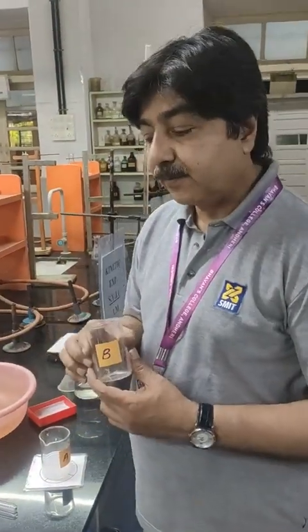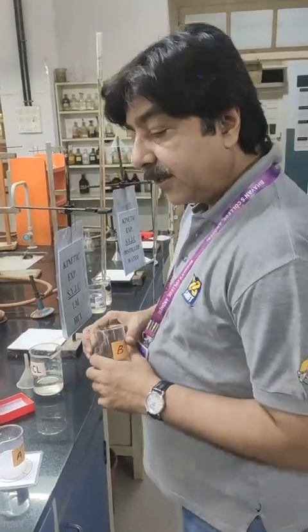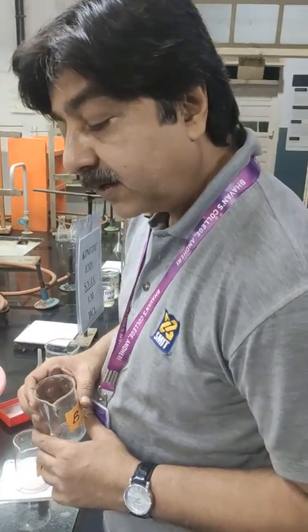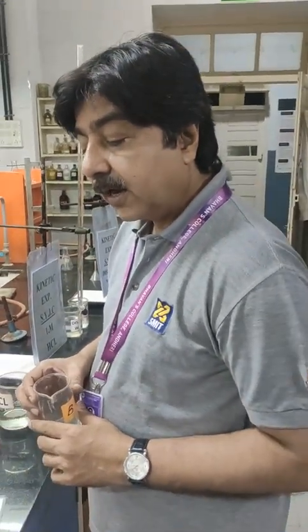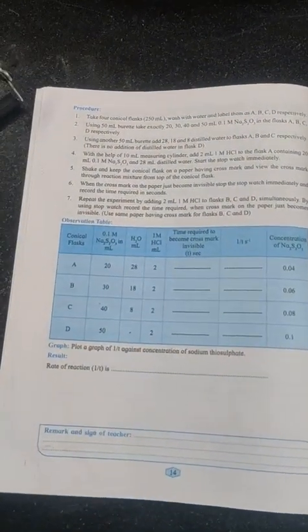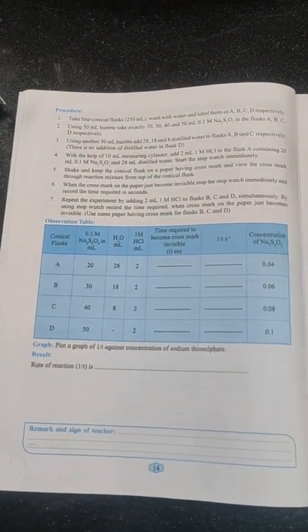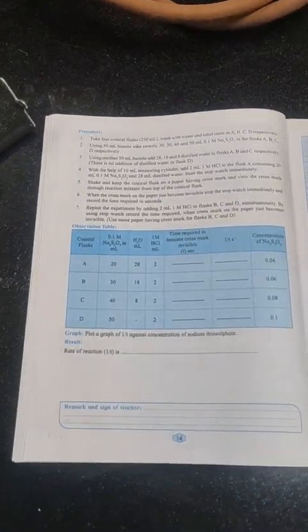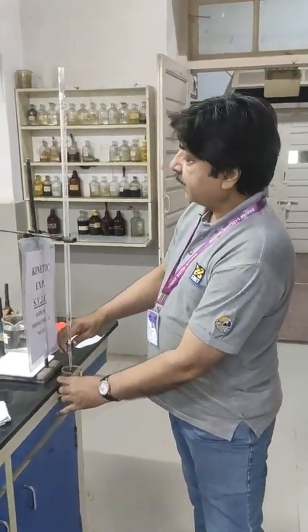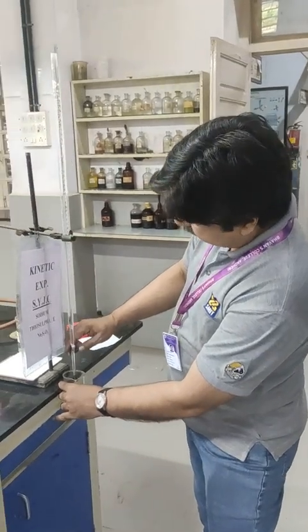I have taken container B. Now in container B, we have to take 30 ml of sodium thiosulfate, 18 ml of water and 2 ml of HCl. So friends, now I am taking 30 ml of sodium thiosulfate solution.